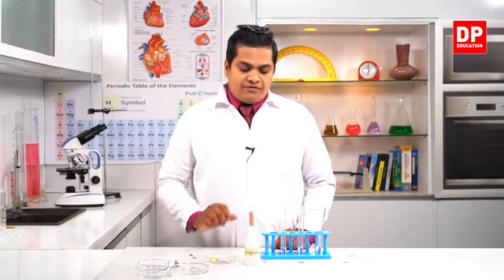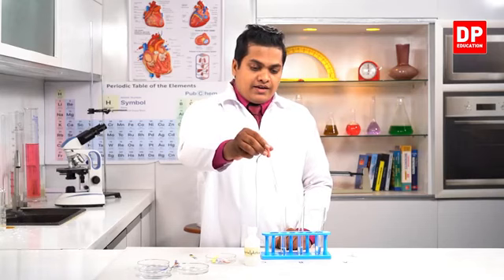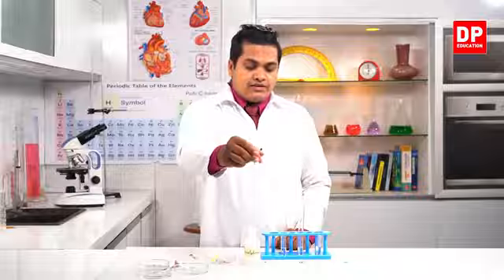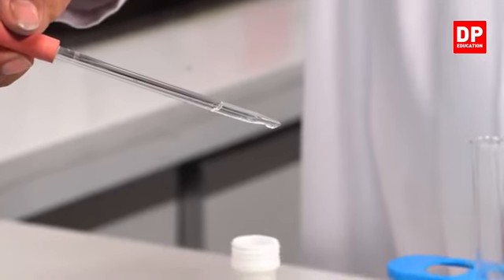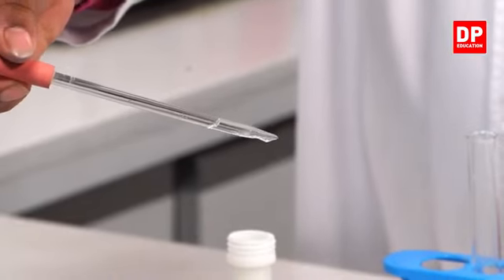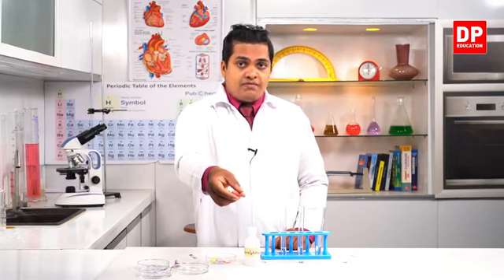The normal color of phenolphthalein is actually, now I have a dropper with me. So let's get some amount of phenolphthalein into the dropper. See, the actual color of phenolphthalein is colorless. See, there is no color. There is no distinct color in phenolphthalein. So with the presence of a base, phenolphthalein is giving out a pink color. Remember, the pink color can be observed only with bases.